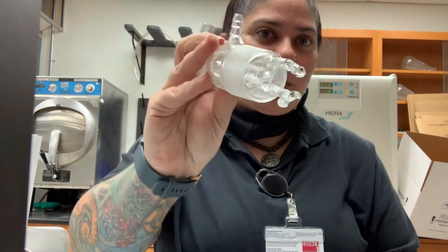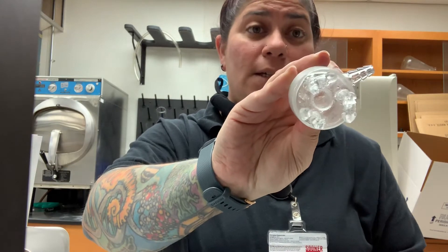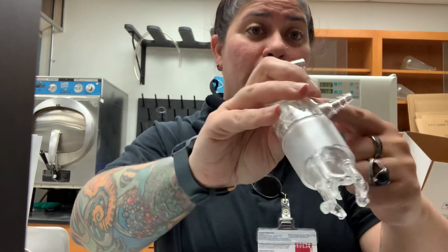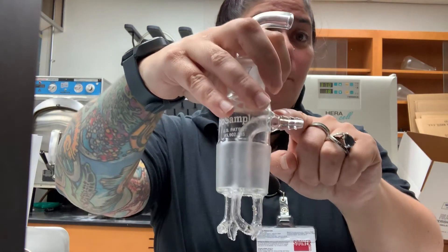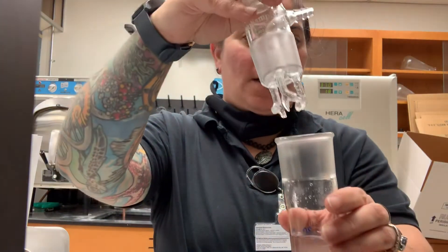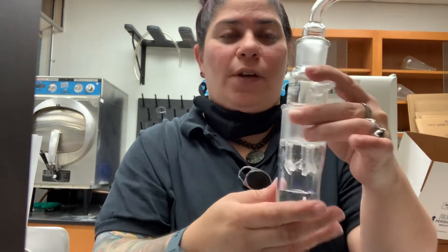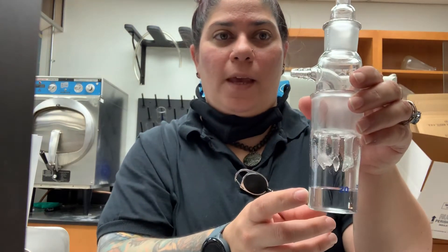There is an exit that allows the air to escape by being pulled through the outlet. This is set inside of a collection vessel. The collection vessel contains a quantity of media and holds 20 milliliters — currently deionized water is in here.